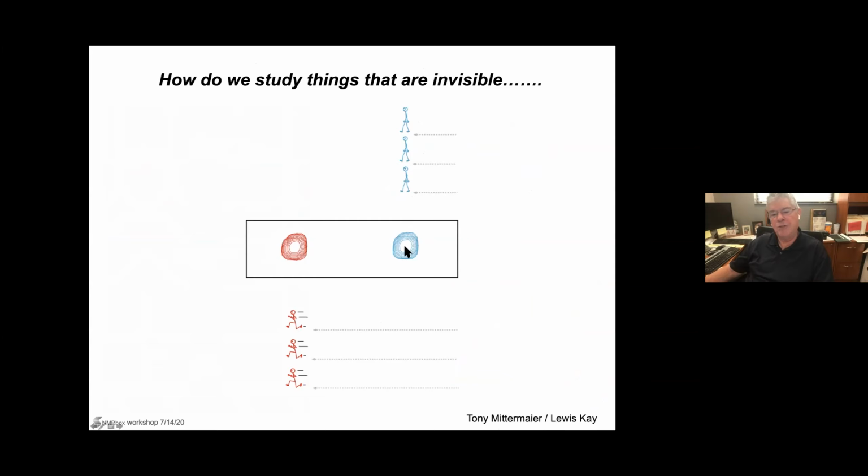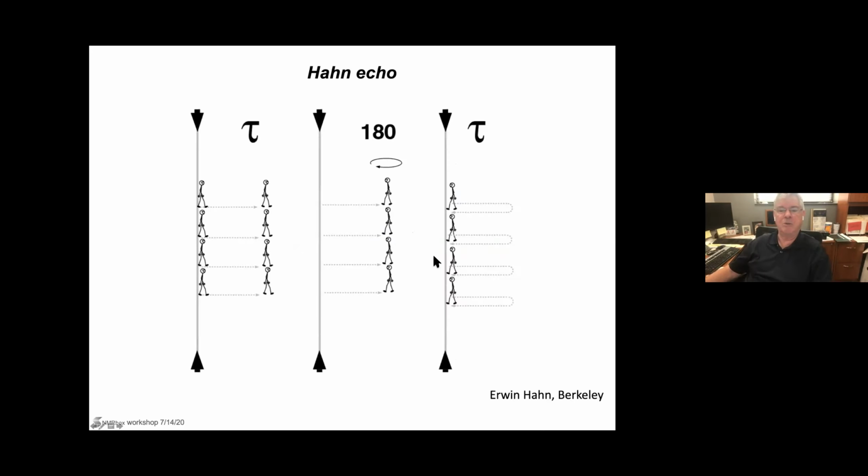If you think of the frequency, this guy has a lower frequency, he's walking slowly. The red runner is going fast, it has a higher frequency. So how do we learn something about this? Particularly if one of these states is only 5%, how do we detect that in the NMR spectrum, quantitate it, and use that information?